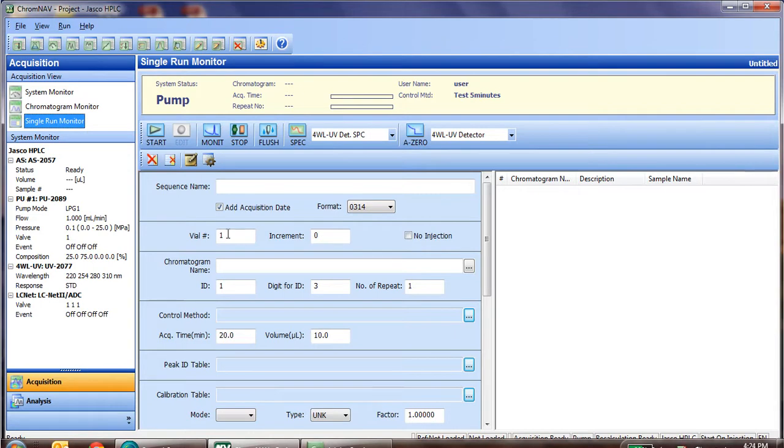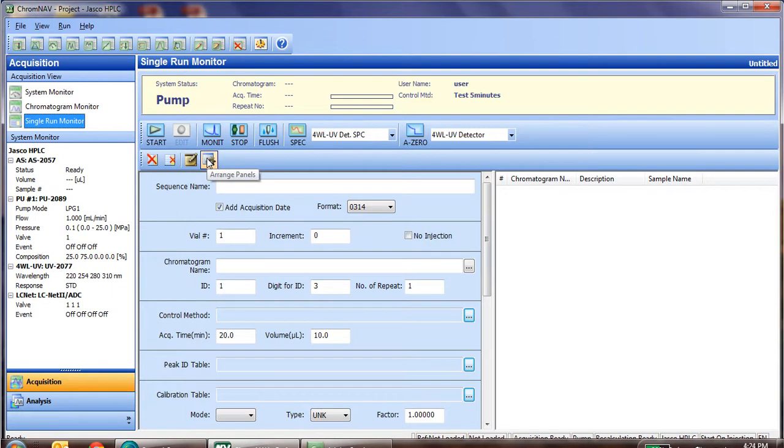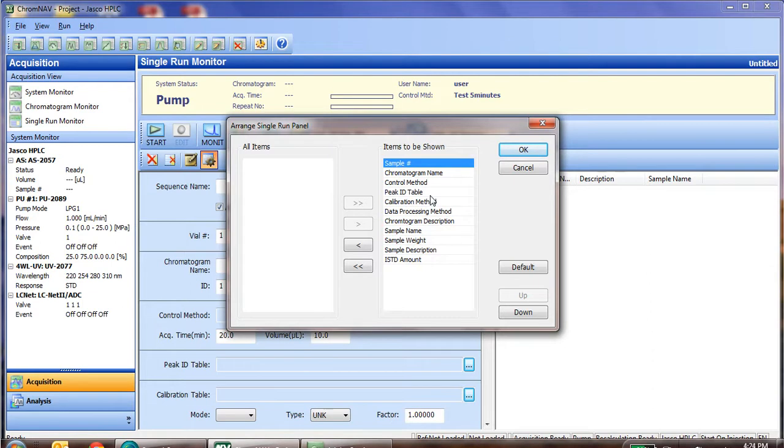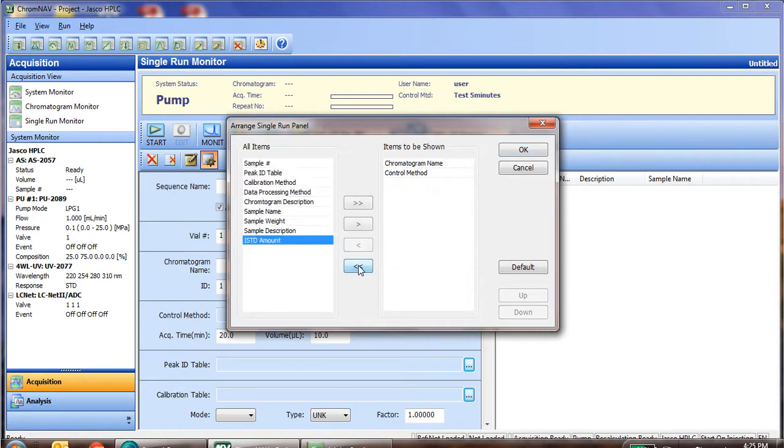When you click on that, you'll see your single run information that you'll enter in below. To simplify this, we'll click on Arrange Panels. Arrange Panels allows us to take away a lot of the data analysis information that we don't necessarily need to include when running a sample. After we learn more about the data analysis features, we can input these into the table, and it will automatically integrate as the sample is running. But for now, let's remove all those unnecessary ones.